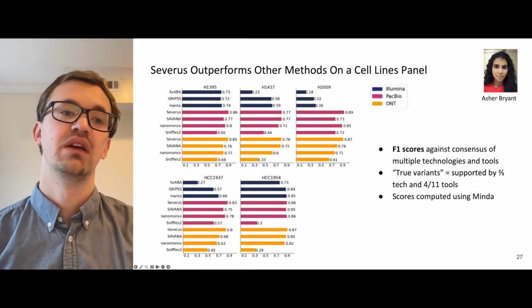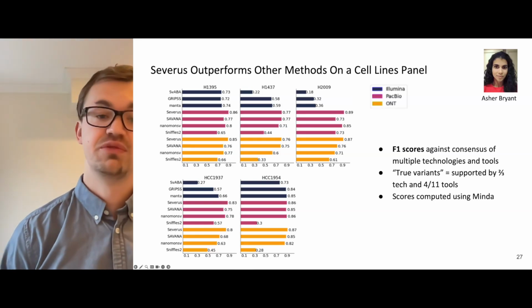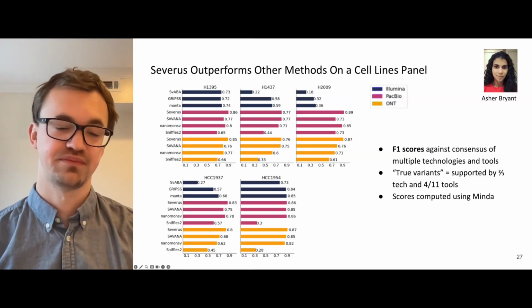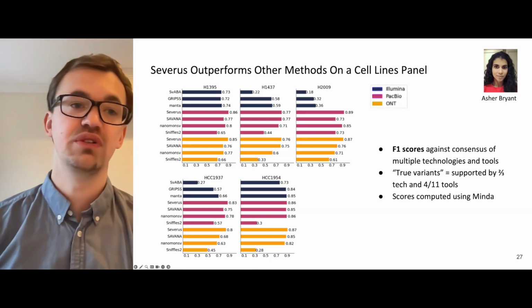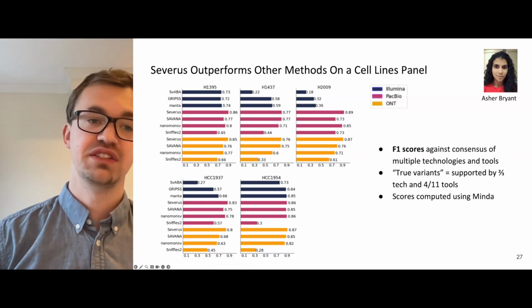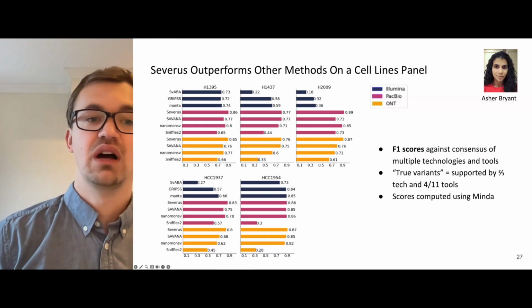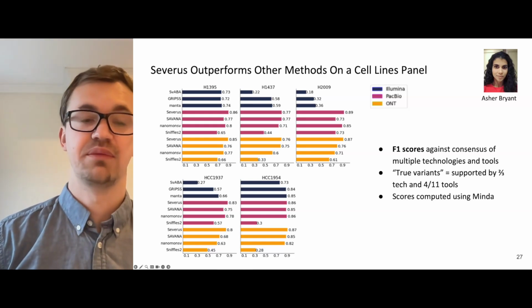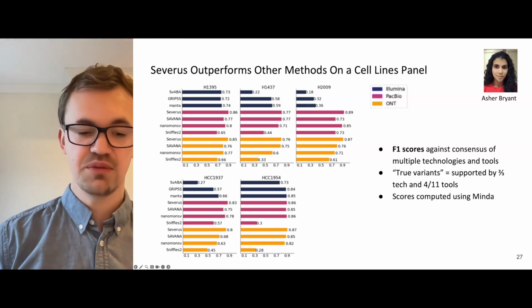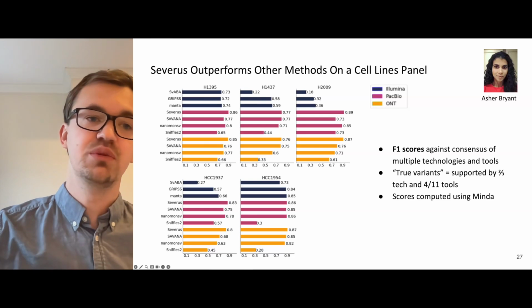We ran Sniffles, and we ran Savana and Nanomonsv, which are recently developed somatic structural variant callers for long reads. Well, first of all, you can see that Severus is consistently either outperforming or performing similar to other tools in both Nanopore and HiFi categories. And most of the time, the long-read-based approach is outperforming Illumina.